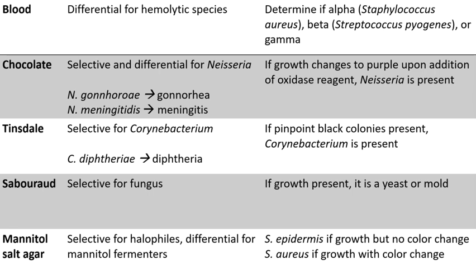Next we have the Sabouraud agar plate, which is selective for fungus. If growth is present, the species on the plate is either a yeast or a mold. If the texture is mucoid or buttery, it is typically a yeast, and if it is fuzzy, it is typically a mold.